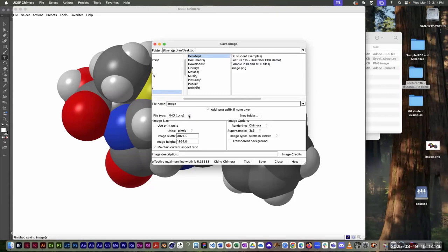File type really, for what we're going to do, we're just going to drop this thing into Illustrator and then draw over it in Illustrator. So the file type for your reference image doesn't really matter that much.